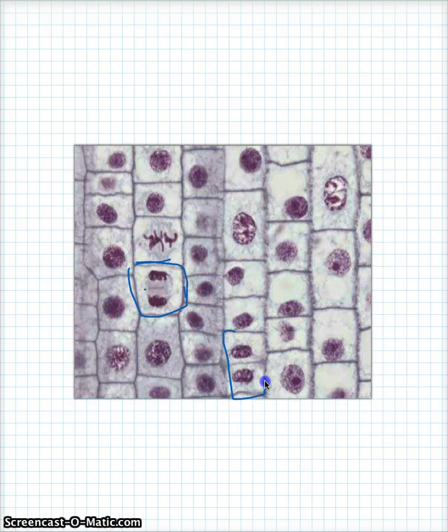This one, much further in telophase. Same phase, but further along. You can see the cell plates really formed, but I can still see chromosomes. So, I know it's not quite finished with mitosis.